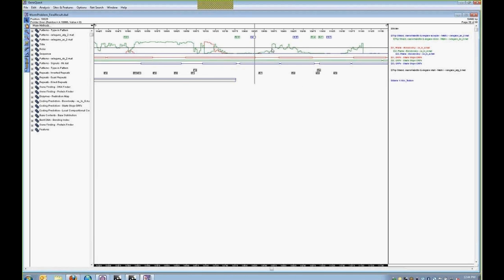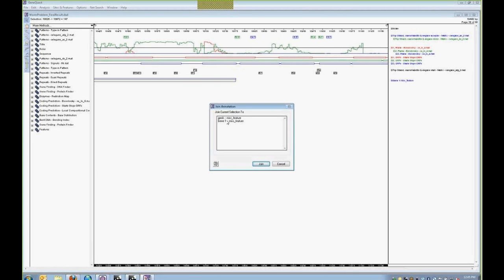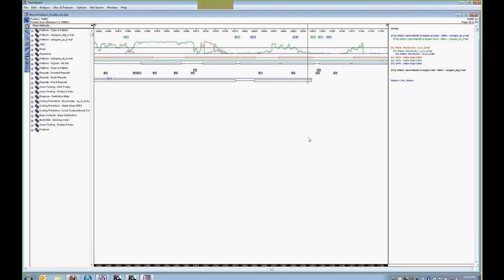And as we move to the end of this Borodovsky peak, we can see that we have 2 donor sites. We have a 6.4 and a 4.7. So most likely the 6.4 with the higher score is the best candidate for our donor site. Go ahead and select that. Choose the linking tool to gene 1. And we have our third exon annotated.